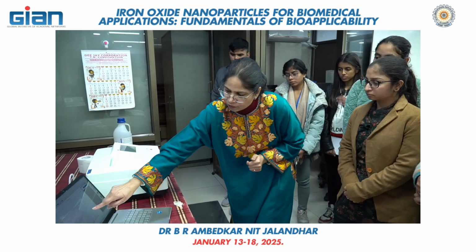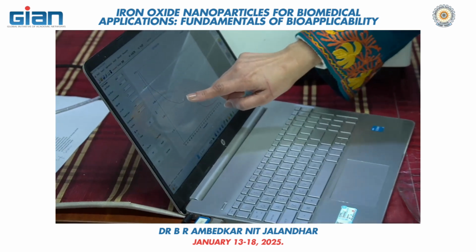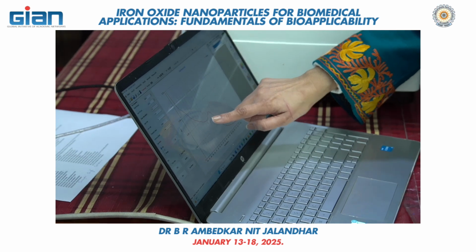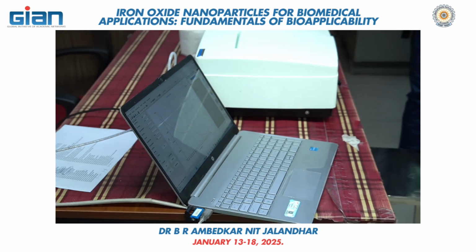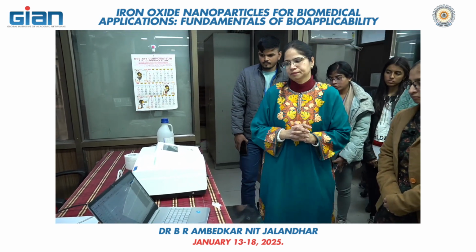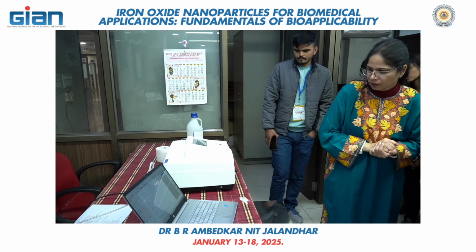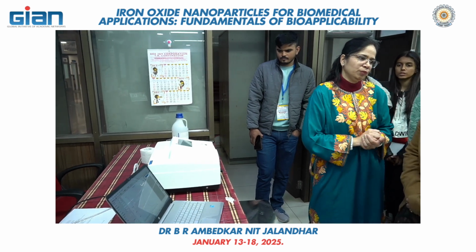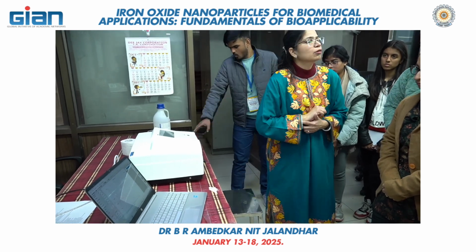Because each and every transition is contributing. So transitions of lower energy are in this area and higher energy in this area. Everything is contributing, which gives a broad band in the UV spectrum. So now you can see the peak is easily visible around 516 nanometer. So now it is confirmed you have synthesized the gold nanoparticle.